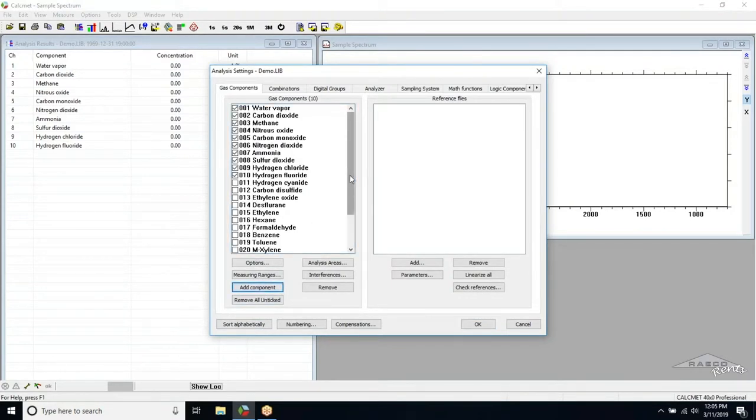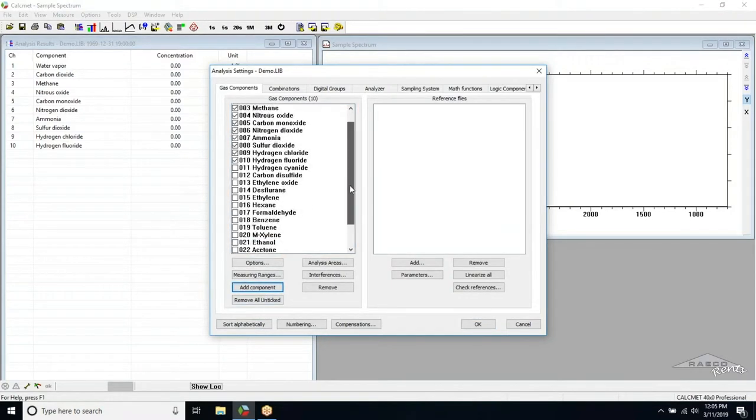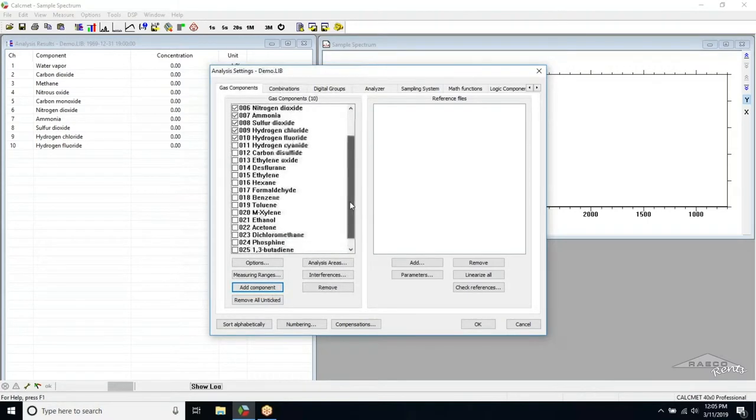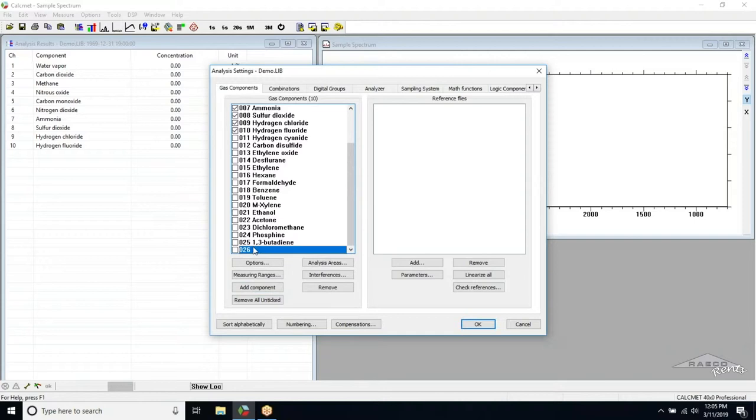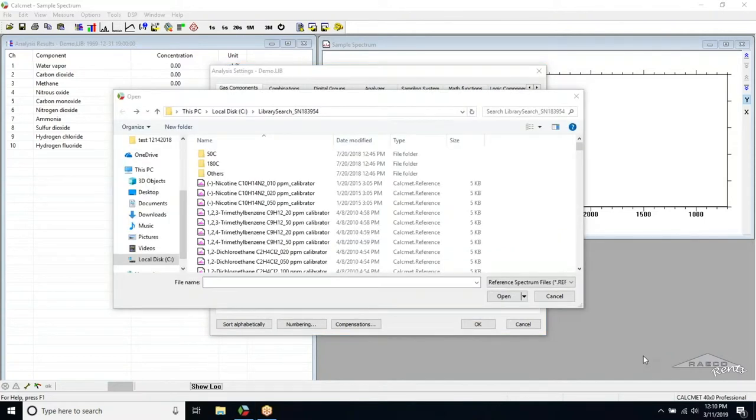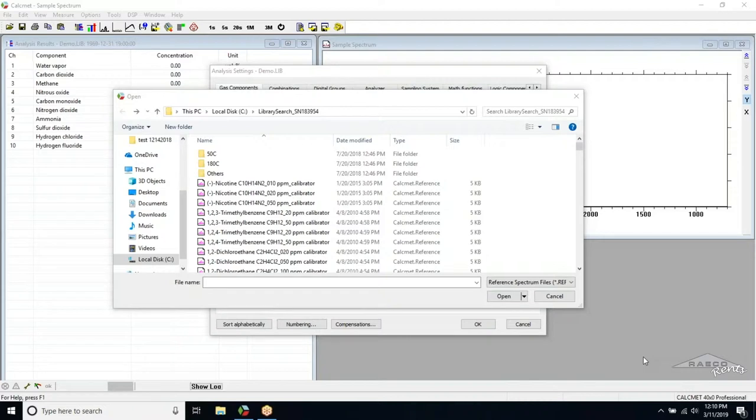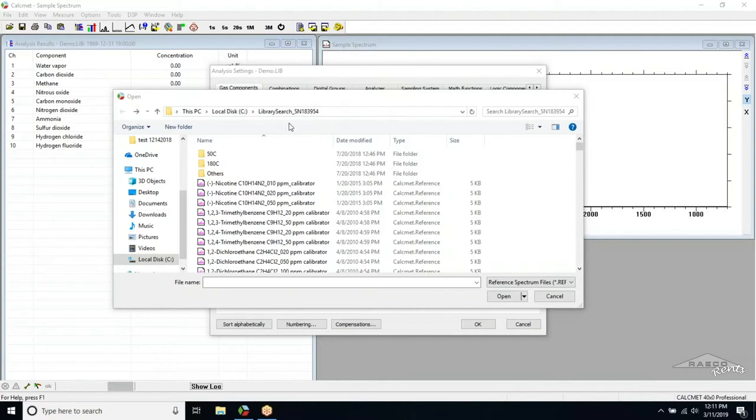This will create a blank entry at the bottom of the list. Scroll down to find this blank entry, click on it to highlight it. Then we will click the Add button below the Reference Files window. From here, we can search the extended library for the Spectrum reference files that correspond to the compound we are looking for. The folder we need to search in is called LibrarySearch underscore Sn, followed by the Unit Serial Number, and it is located at the root of the C drive.